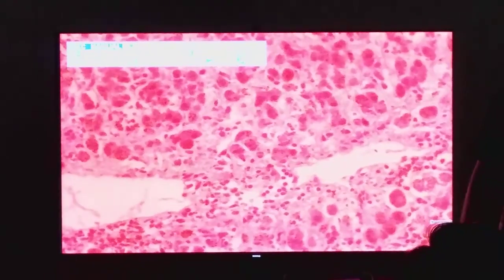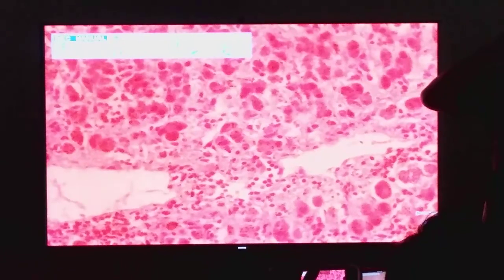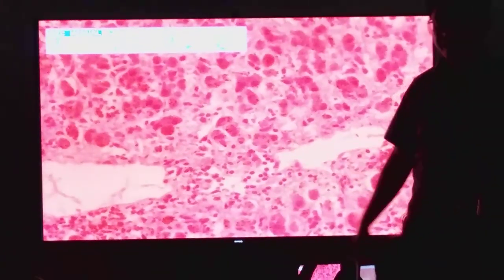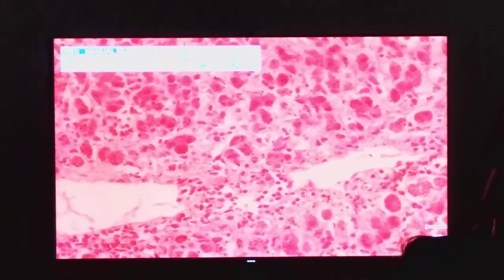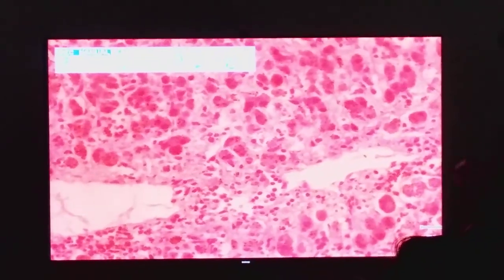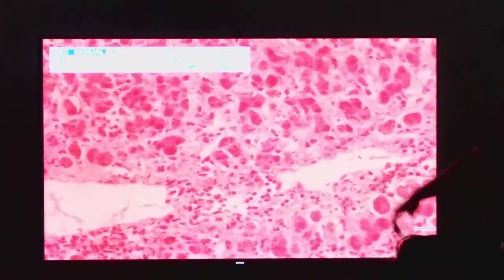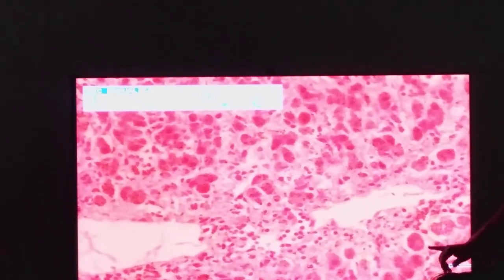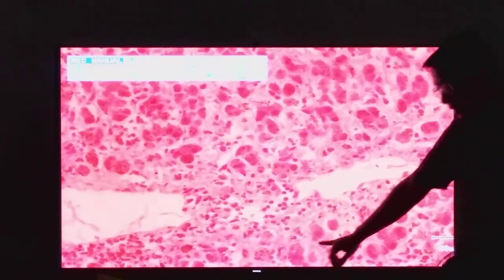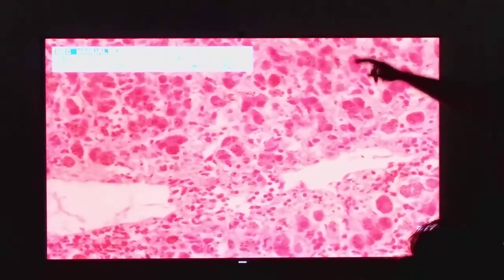That will now be your assignment. Identify the zone pointed. Reticularis. How about this zone? Reticularis. How about above the reticularis? Okay, how about this layer? How about these cells? Chromaffin cells. Do you have any question? You may now borrow your microscopes and study your slides.